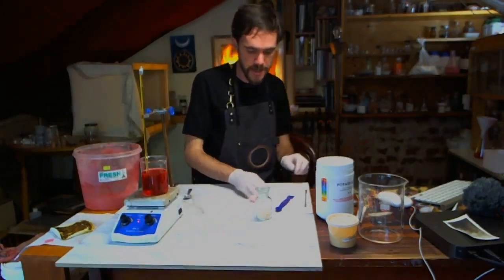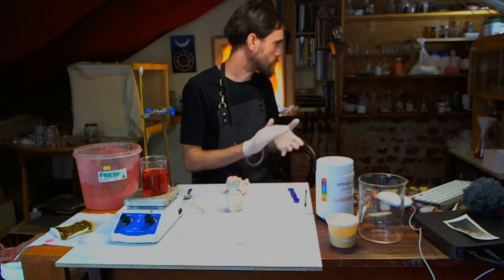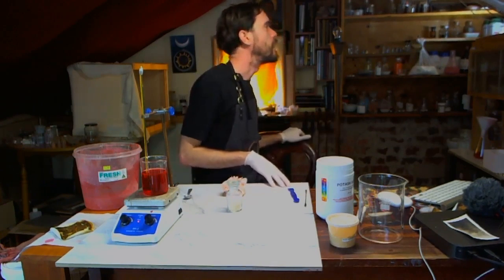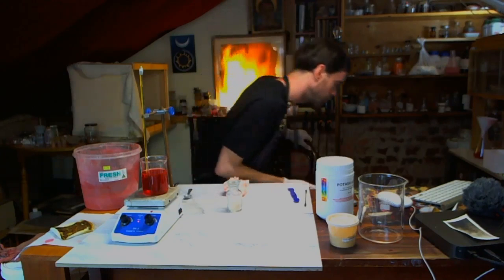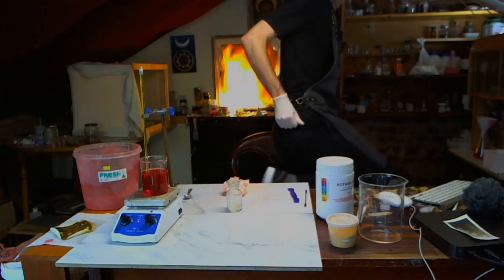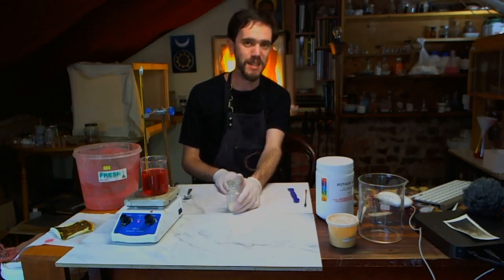How do you get lead acetate? So I made this lead acetate by, what I did is, essentially I just got an Erlenmeyer flask. Hang on, I will show you. Basically you just boil lead in acetic acid.